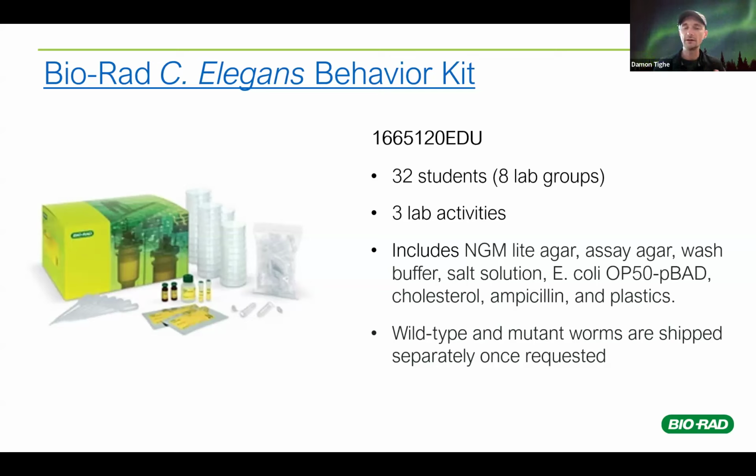The one thing that's very different about this lab compared to other Bio-Rad labs is we don't send you everything at once. We send you all of the stuff to prep your plates and make all the student stations, but we keep the worms cold on our side until you say, hey, I'm ready for them. By ready, we mean you've poured your plates and you've got E. coli growing, so you're ready for worms to show up and for you to take them out of the cold storage and put them onto plates with E. coli so that they're ready to feed. There'll be a little call-in card that comes with the box, so when you're ready, you call in and say, hey, I'm ready for my worms, send them.